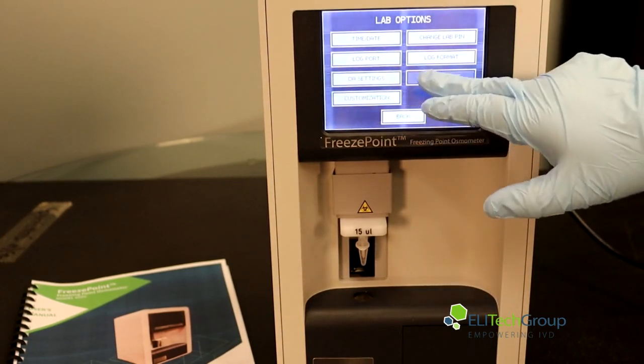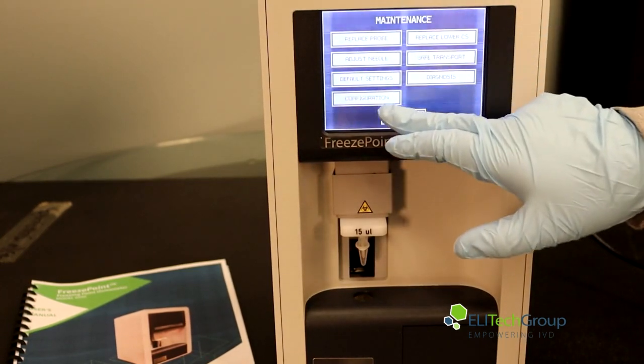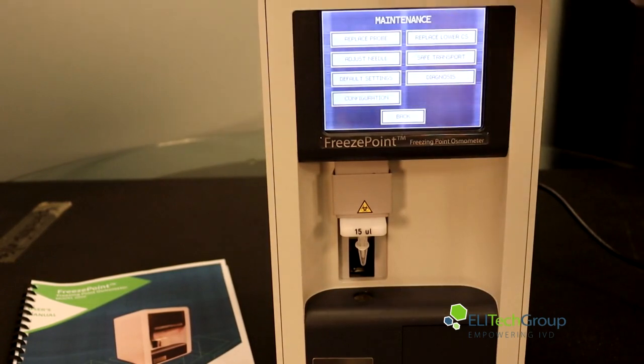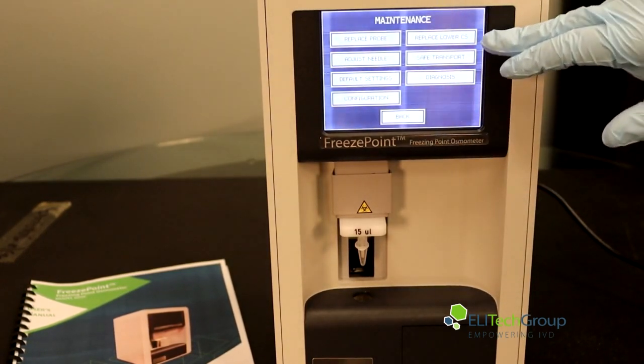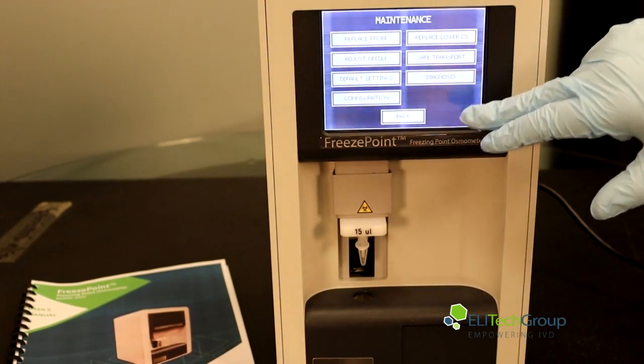You can go into your maintenance setting, where you will be able to replace the probe, adjust the needle, access default settings, configuration, replace lower CS, safe transport, and diagnostics.